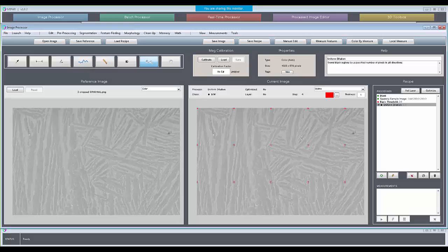And we could be mistaken, but especially if you're going to take multiple images and have the uncertainty be the variation from image to image, then it really doesn't make sense to me to point count a segmentation, because you can already view a digital representation of your microstructure as just a very dense point count. Every pixel of your image is a point that you've laid down on the microstructure, and your segmentation is telling you what points are hits and what points are misses.